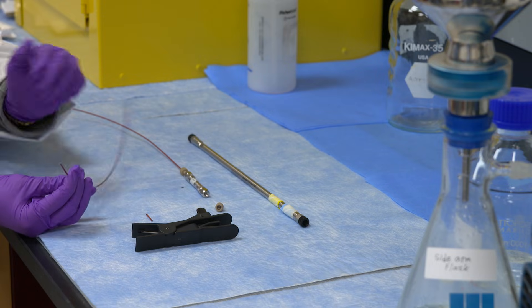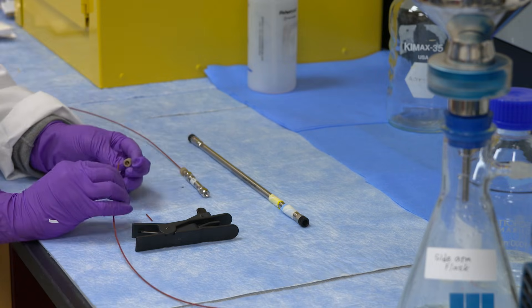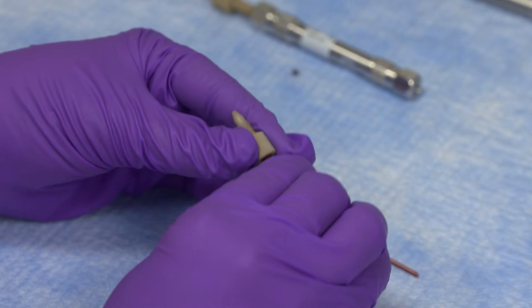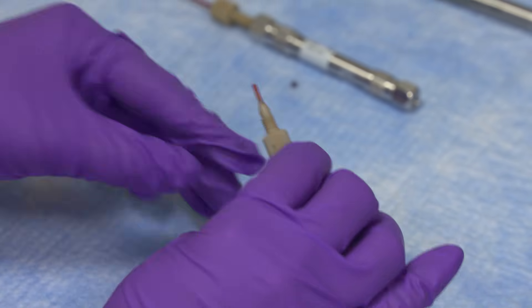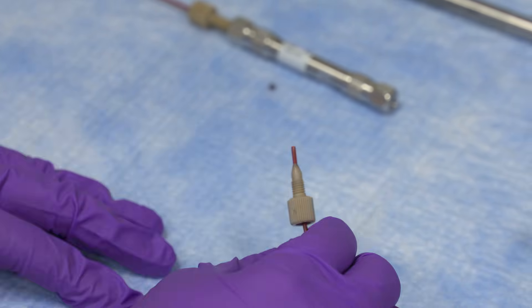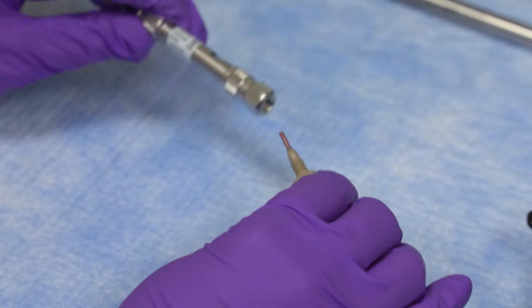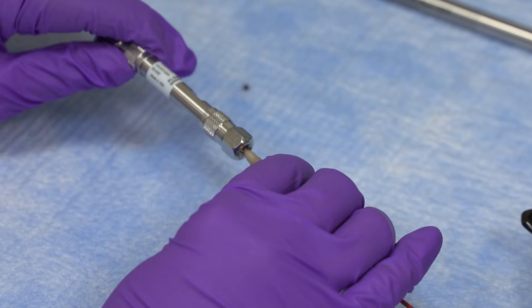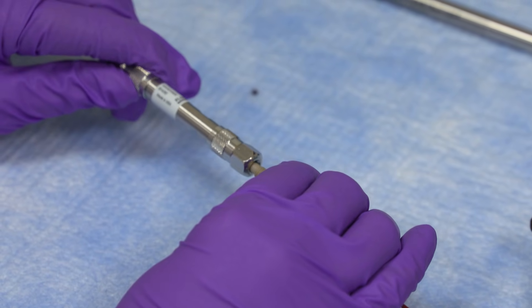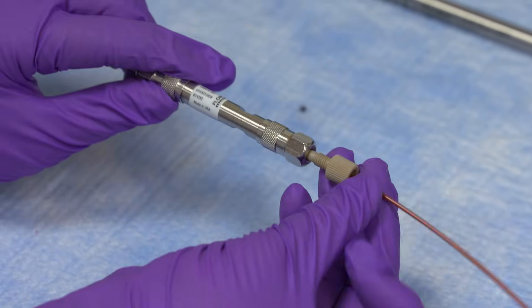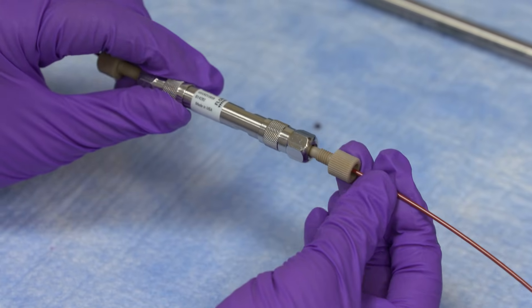You take this end of the peak tubing, insert it in the ferrule, just about an inch from this side. Take the ferrule and you attach it to the column. To know which side you will attach this ferrule to is by knowing the flow of the solution in the column.